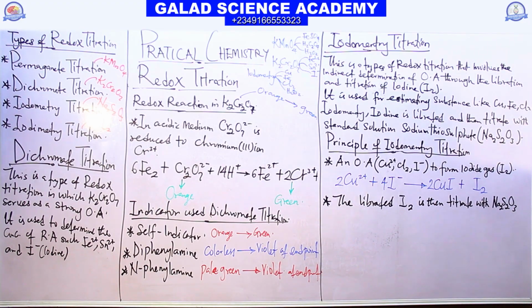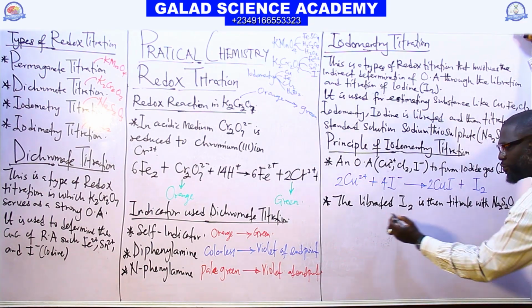So the next thing that we do now is we will take this iodine and titrate it with sodium thiosulfate.